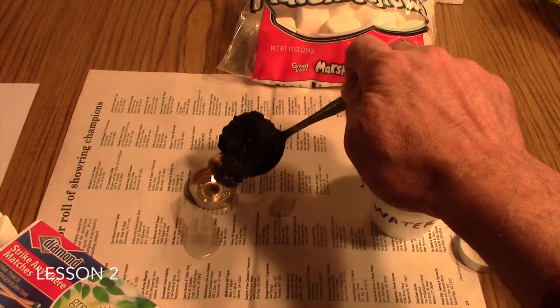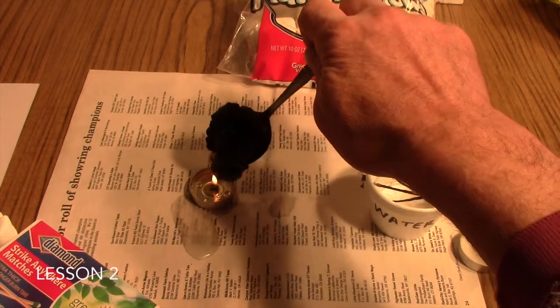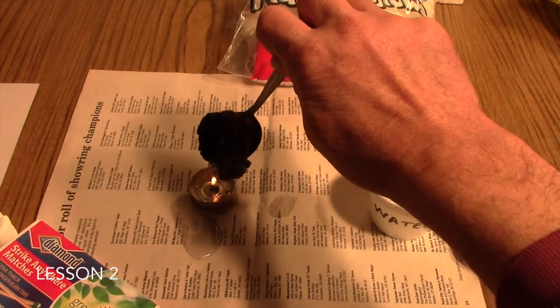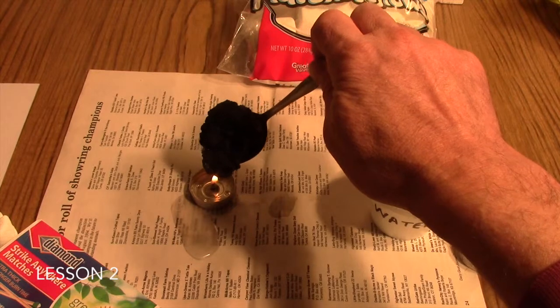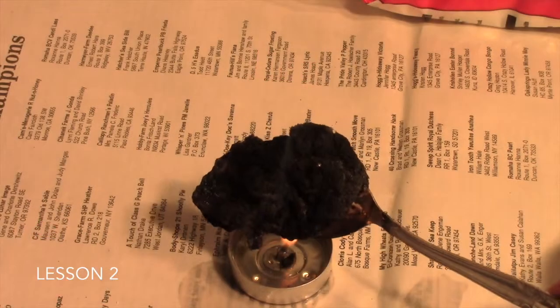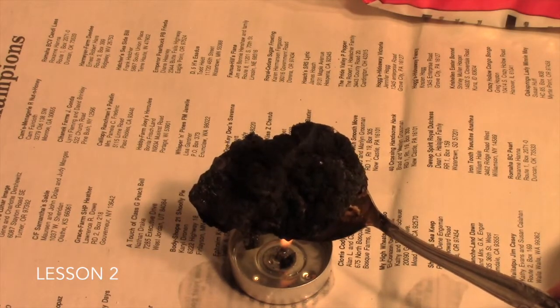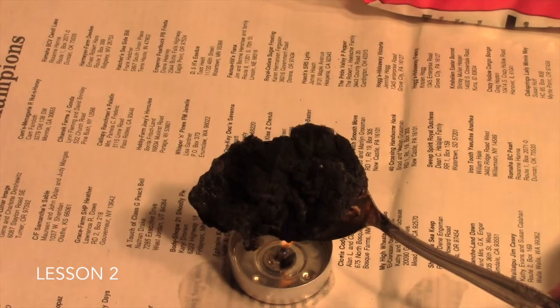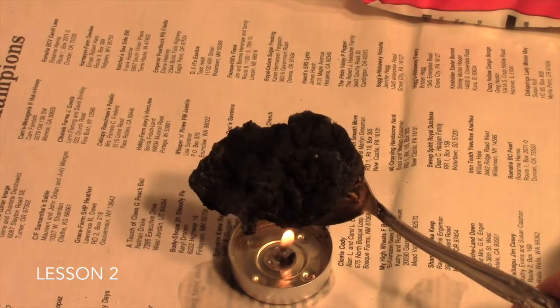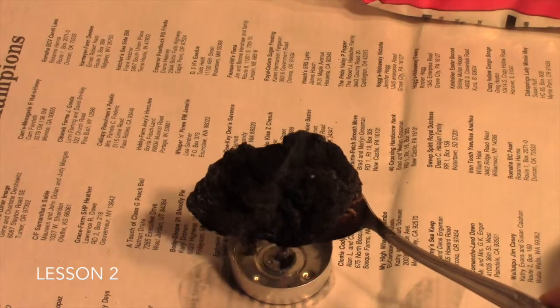The goal is to just totally burn out that marshmallow. A sign that you've got it totally cooked is when the smoking completely stops. You'll also hear some crackling sounds when the marshmallow is totally incinerated.